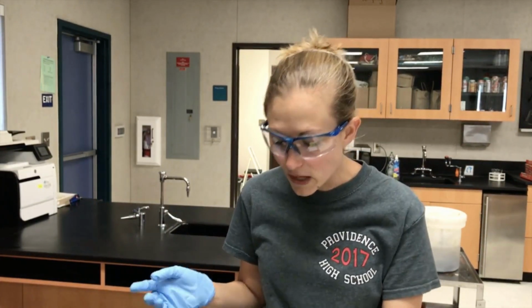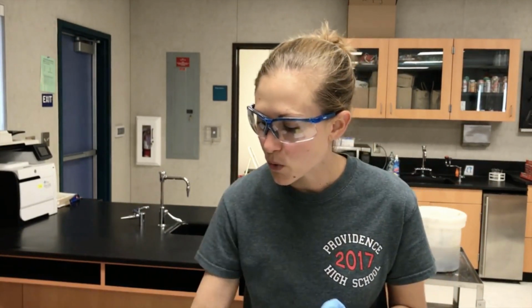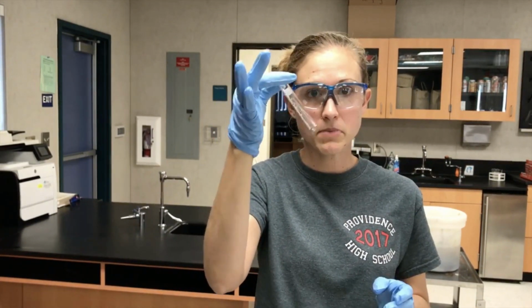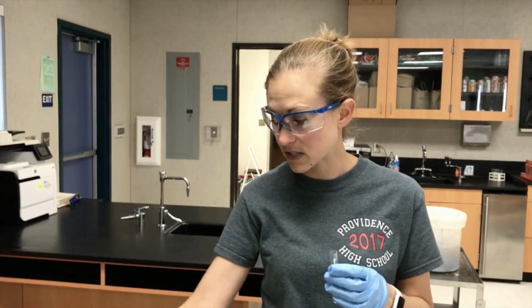Well, in order to do that, we need 5 different solutions with different concentrations. So we have one solution already. It's 0.4 molar copper nitrate, and now we need to create the other 4 solutions. So I'm going to show you how I created the 0.2 molar solution. So you're going to get a total of 6 cuvettes. Okay, so these are glass, be careful with them because they can break. Now, I'm going to fill one of them with water, and then the other 5 are going to have solution.